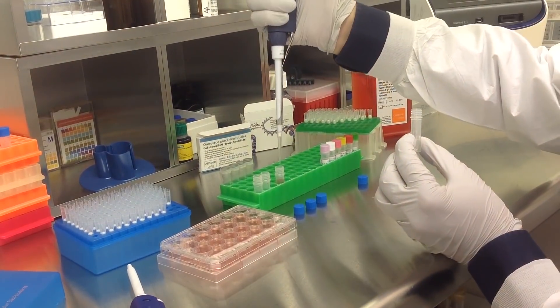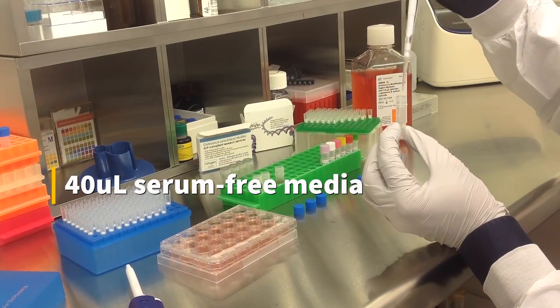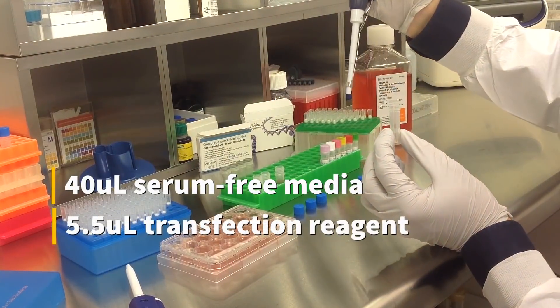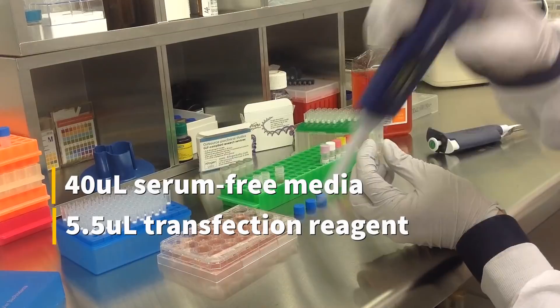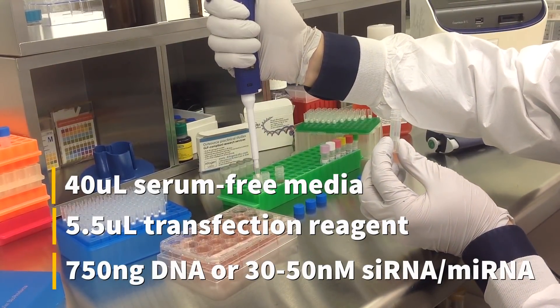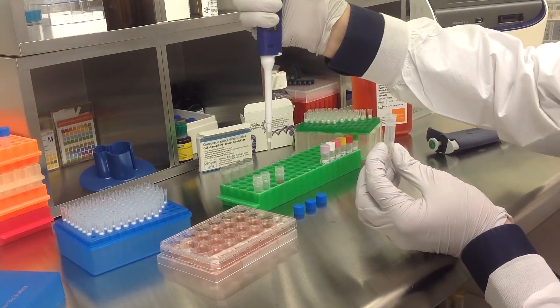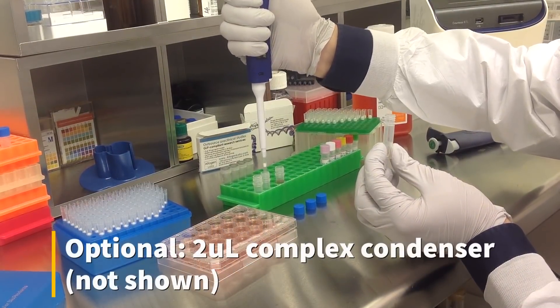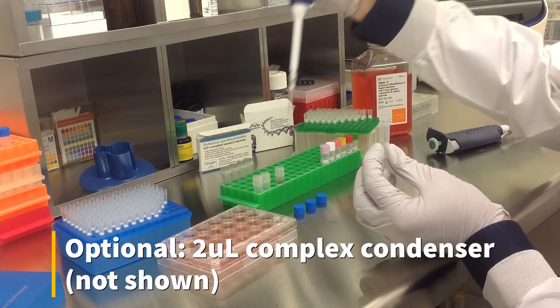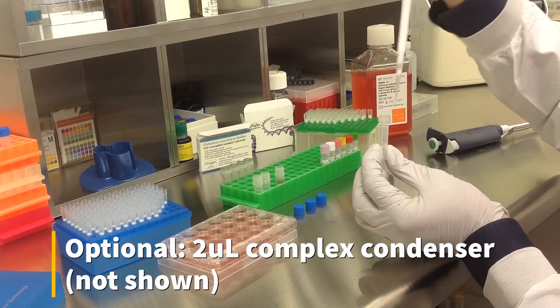To prepare the transfection complex, mix 40 microliters of serum-free medium, 5.5 microliters of transfection reagent, and either 750 nanograms of DNA or 30 to 50 nanomolar siRNA or microRNA. An optional step is to add 2 microliters of complex condenser, which increases transfection efficiency but may also increase cytotoxicity.